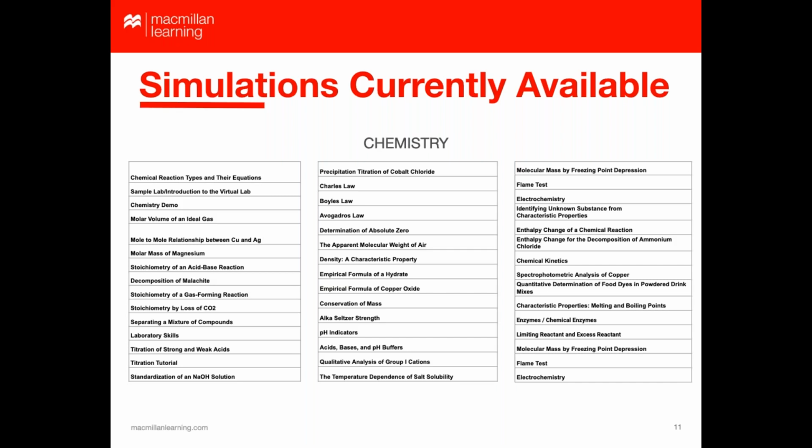Yeah, the only customizable part, I'll chime in a little bit, is what's on the shelf inside the lab. If all of the chemicals are on the shelf in the lab, I encourage you to try them all out, run your experiment as you're writing it, just to make sure it does what you want it to do. But then being able to write a procedure to go along with some different chemicals that are currently in that lab itself is definitely possible.